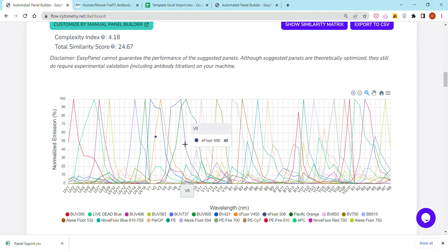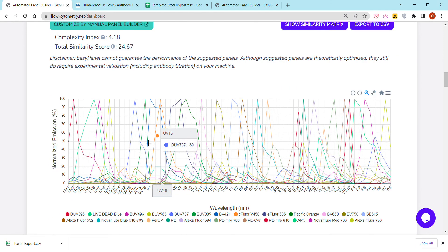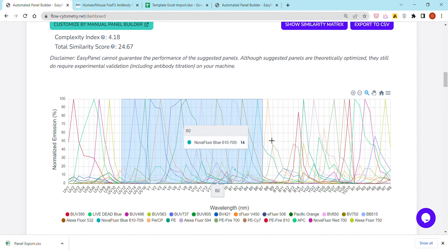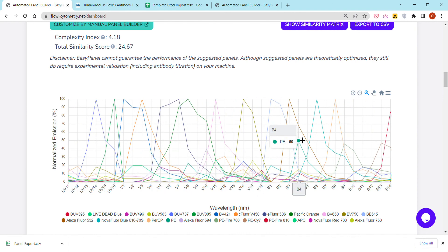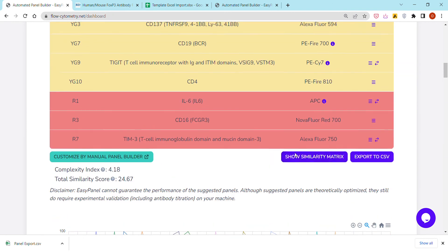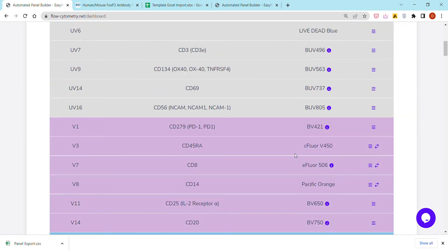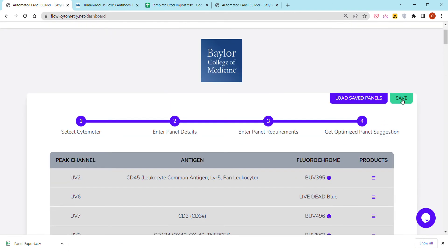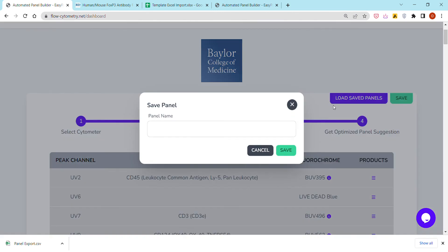You can also visualize the spectrum viewer corresponding to the spectral signatures of the different fluorochromes. Zoom in, move to the right, move to the left. You can save the panel to your own account.